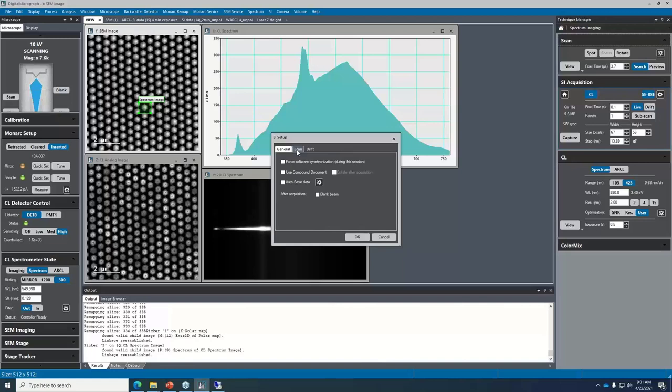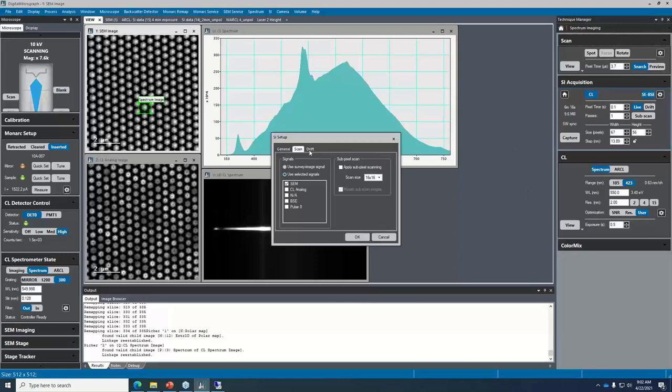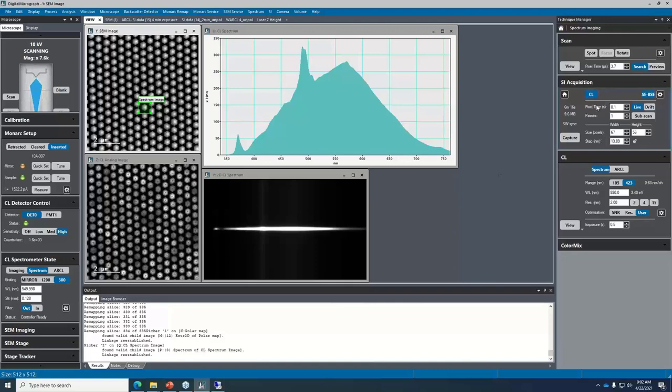A spectrum image is the same as hyperspectral imaging — those terms are interchangeable. Digital Micrograph allows sub-pixel scanning to avoid missing information. I'm going to get an idea of how strong the spectra are if I reduce the dwell time for the camera, turn on full vertical binning, and collect about a two-minute spectrum image.